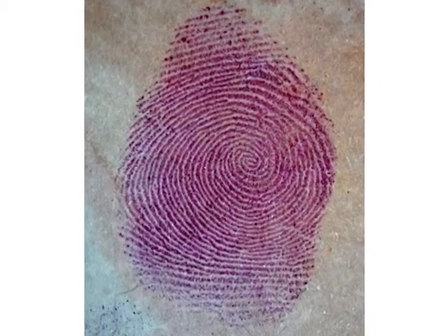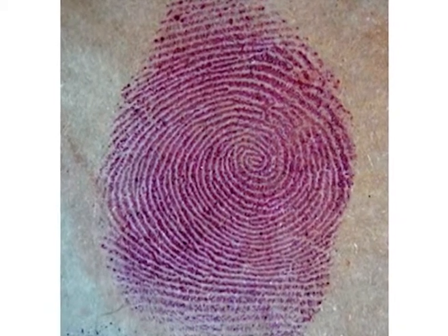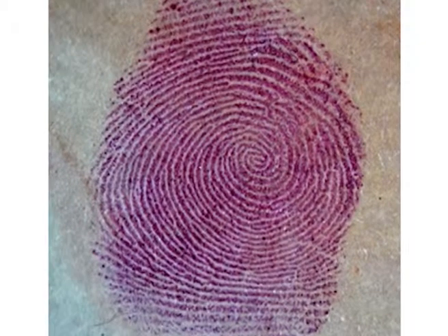During experimentation, there are several parameters that need to be adjusted for adequate and satisfactory development of fingerprints. There are chemical parameters such as the concentration of Ninhydrin, the nature of solvent and the acidity of the formulation, as well as physical parameters such as the mode of application, heating temperatures and relative humidity.